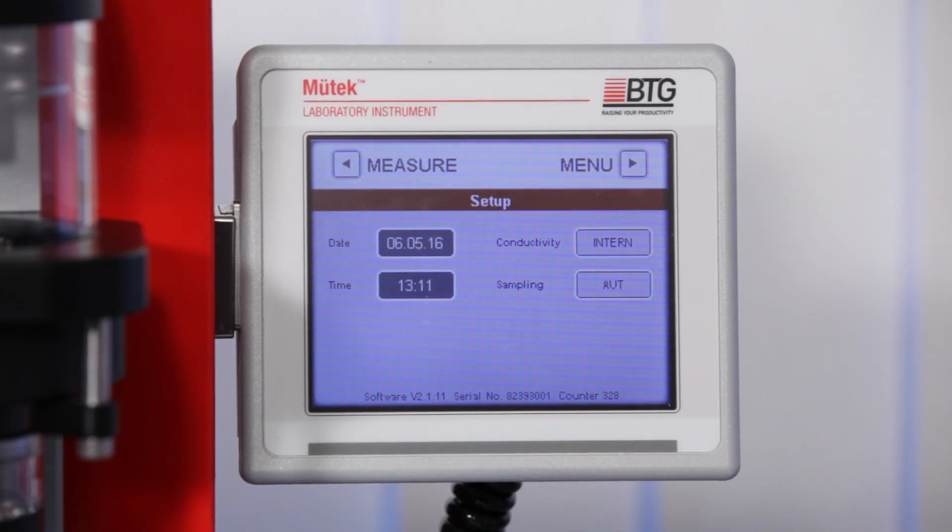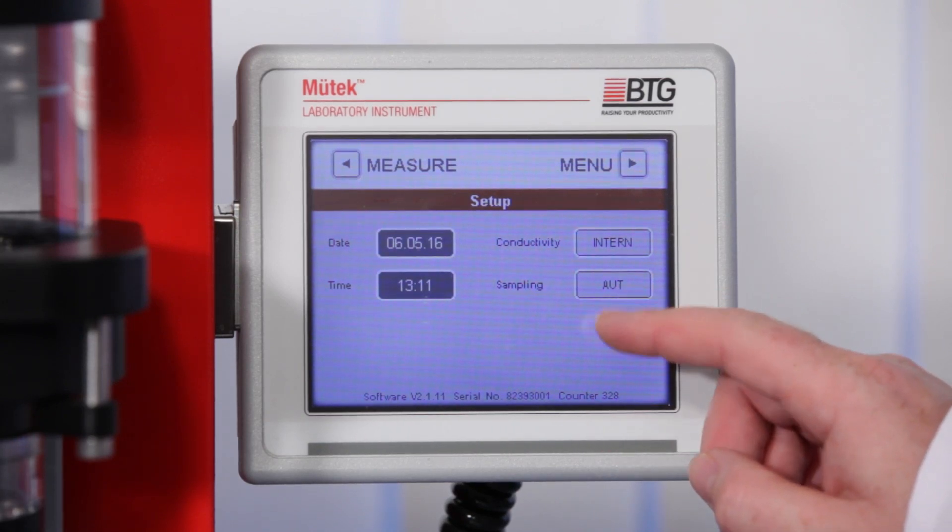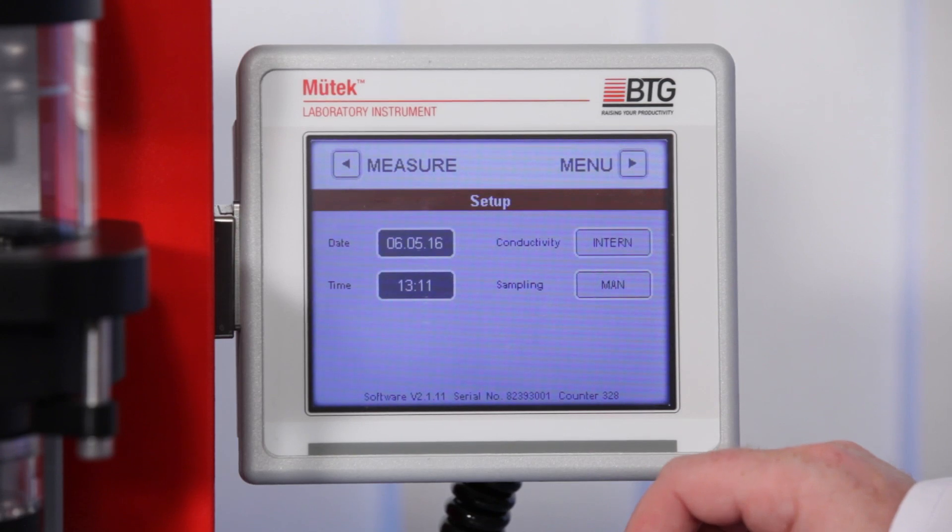In automatic mode, the SZP runs an automated sampling procedure according to the chosen sampling parameters. In manual mode, you can control sampling via the display.